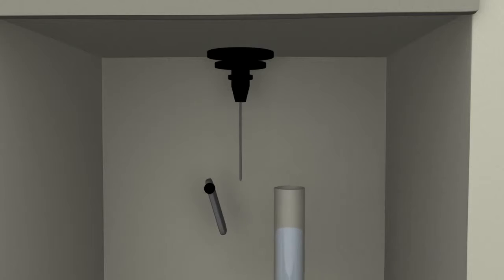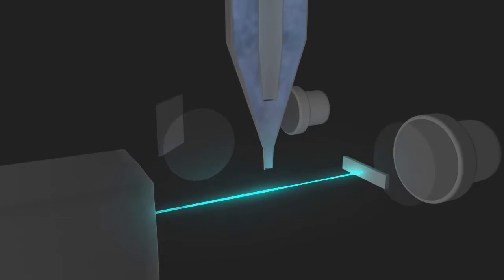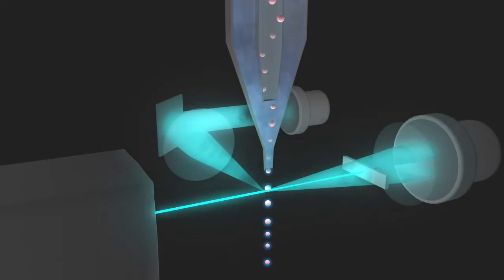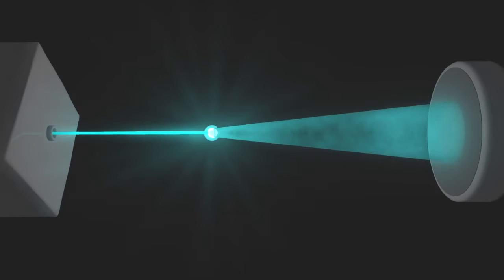Once a sample has been placed in the flow cytometer, the machine will suck up the sample, mix the sample into a stream of saline solution in the cytometer, and lead the cell suspension through a narrowing channel, causing the cells to form a single file line before the cells pass through the laser at the interrogation point. Each cell within the sample then moves across the laser beam, allowing each cell within the sample to be individually analyzed. As each cell passes through the laser, the beam will scatter in multiple directions.